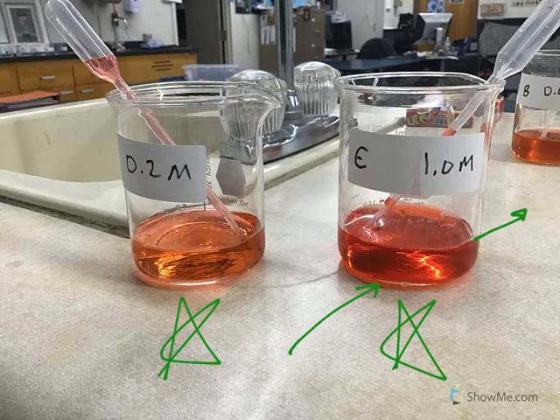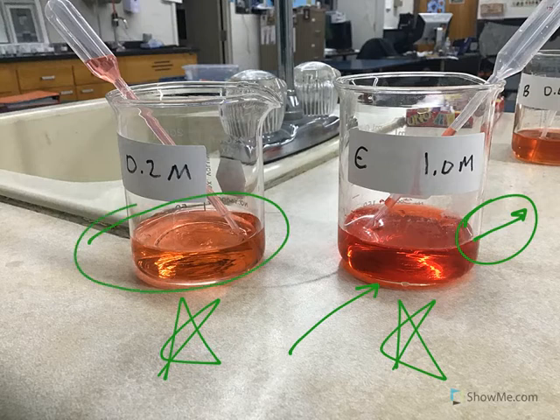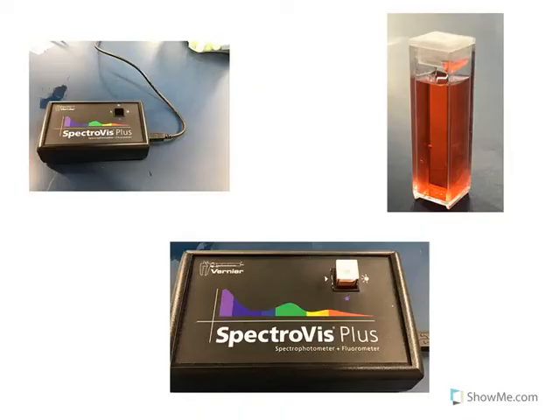If we use a spectrophotometer, we can capture that light that comes out, and that will let us know how much was actually absorbed by the solution. Again, since this one on the left is of a lighter shade, it will absorb less of the light, meaning it will have a lower absorbance. So by relating these absorbances, we can determine the concentration of these solutions.